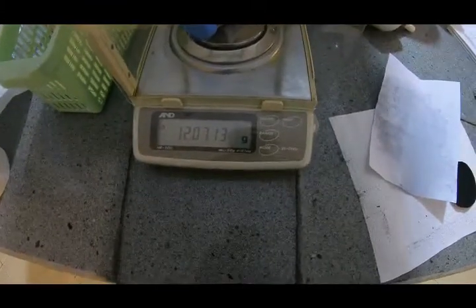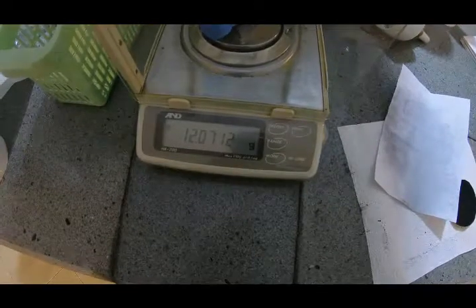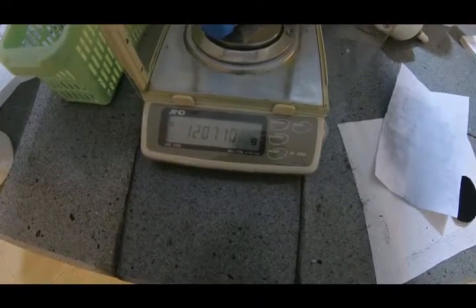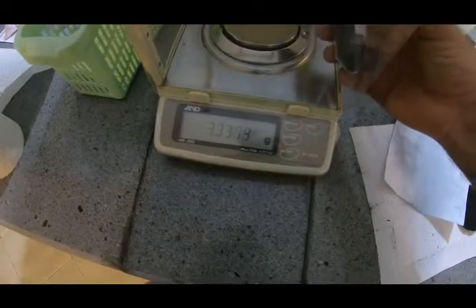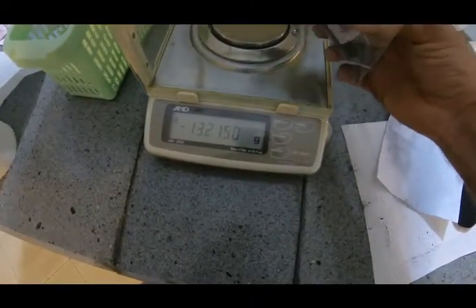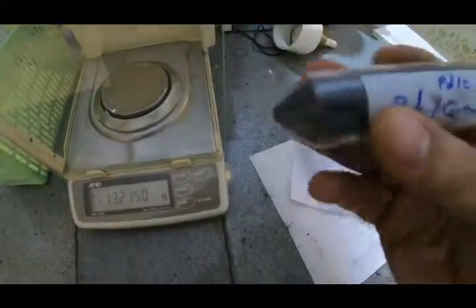It is around 12 grams, so it definitely holds a little bit of moisture. I will keep this in a desiccator to dry it further. So there you have it, palladium on carbon.